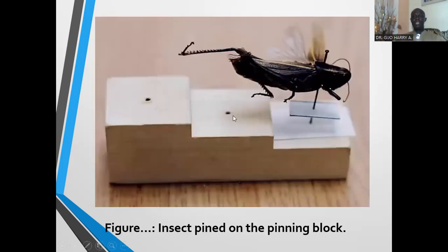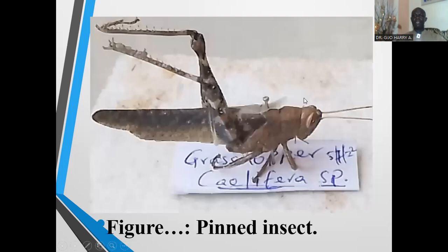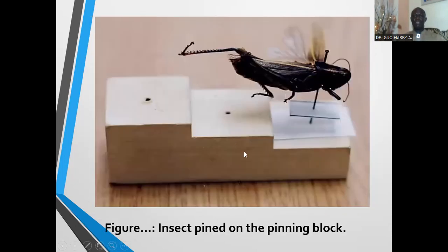Now here is a typical example of an insect that's pinned in the pinning block. You have the insect and then the data label that's been attached to the pin, and this is the pinning block. The insect is pinned in the thorax, in the cephalothorax. The pin is pushed from the top to emerge from the underside of the thorax and is then pinned on the pinning block.